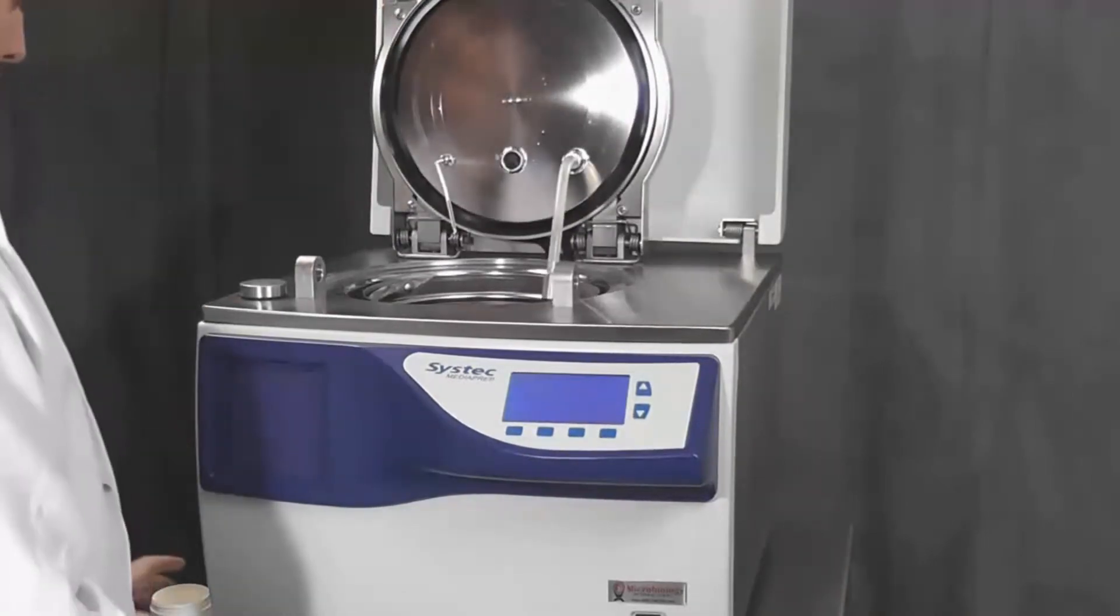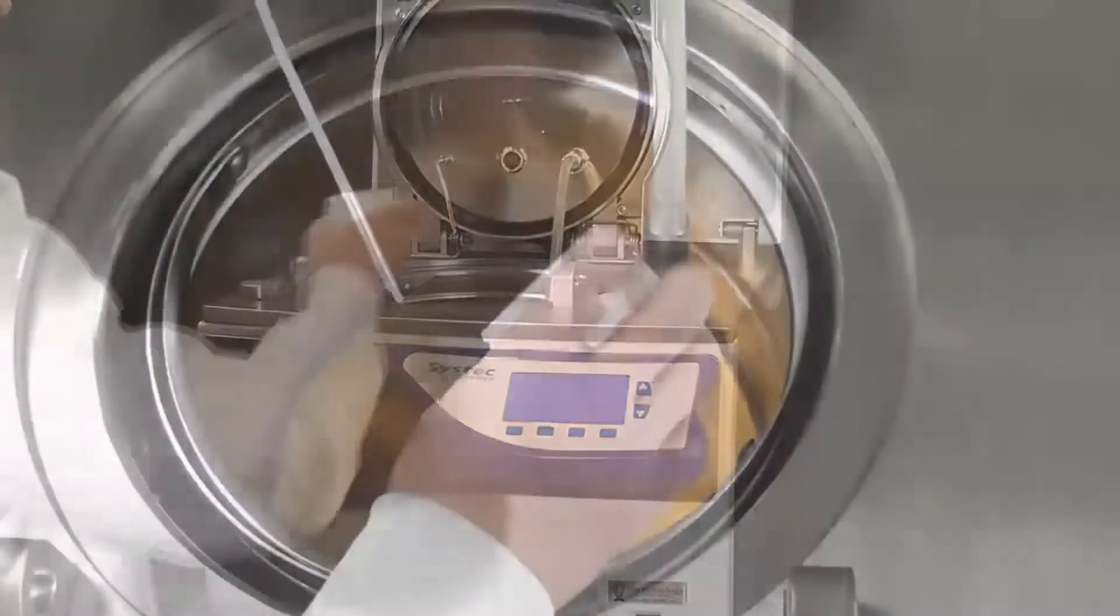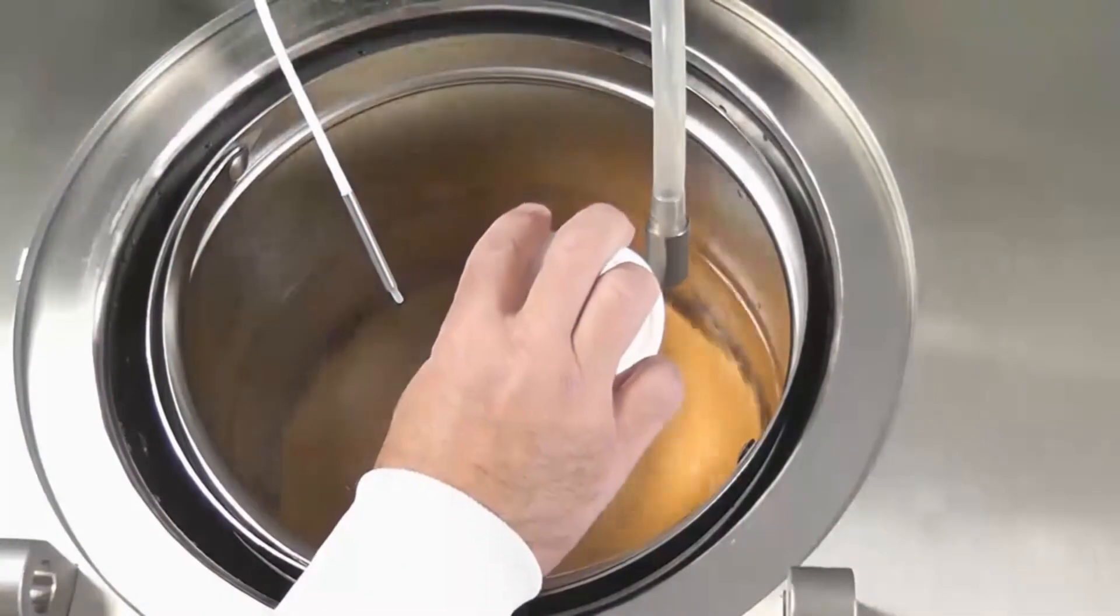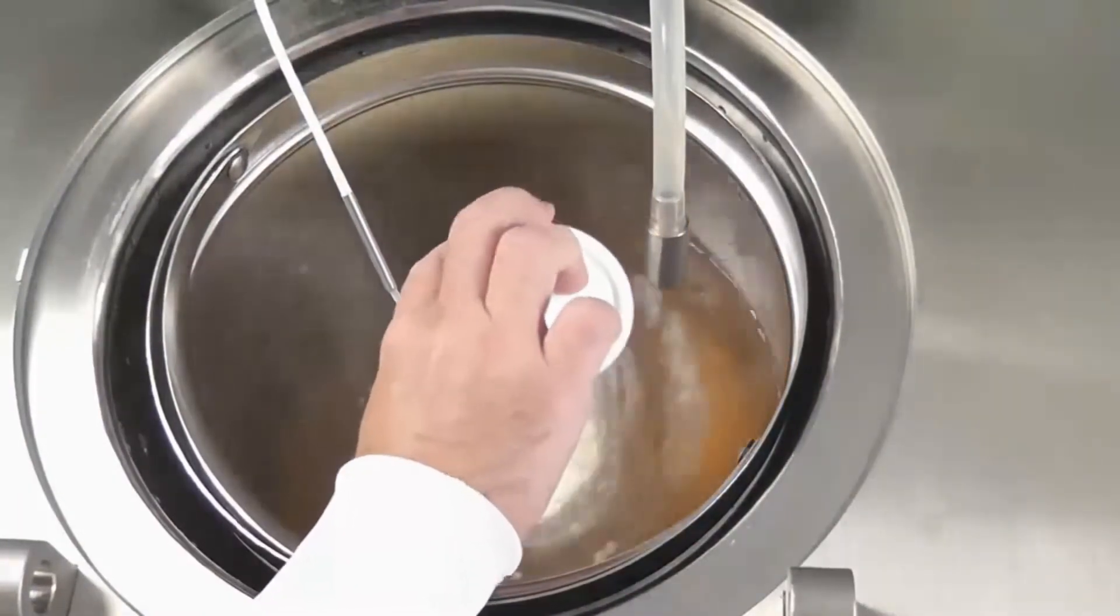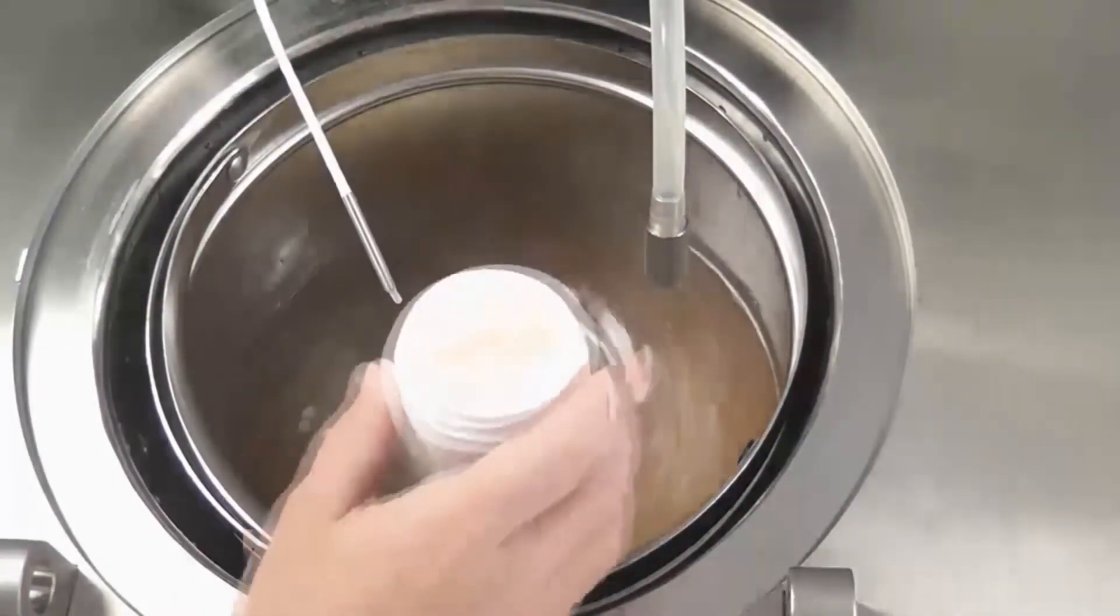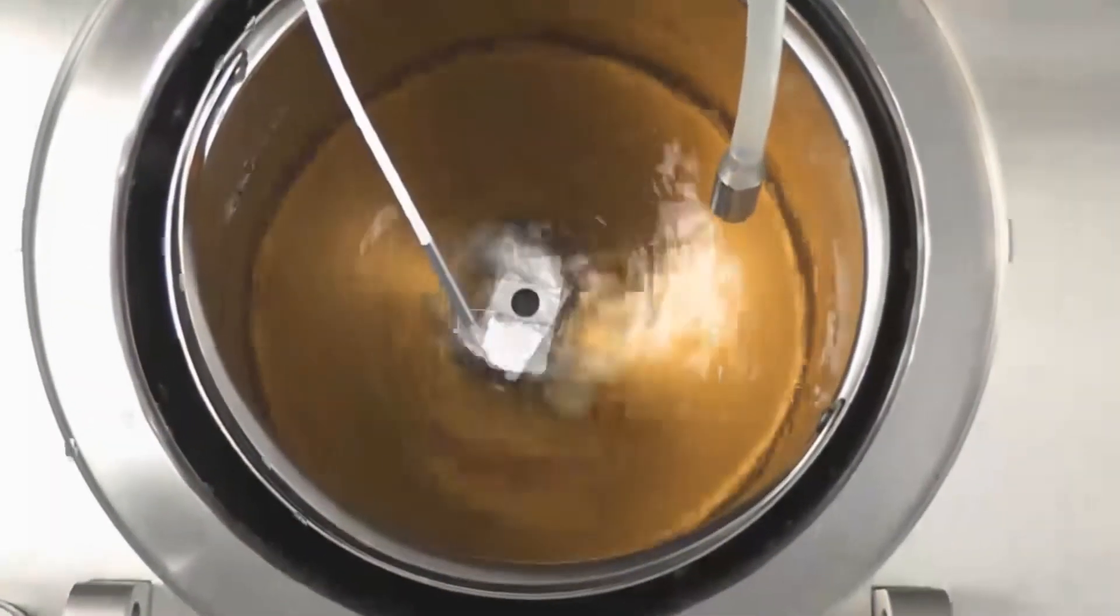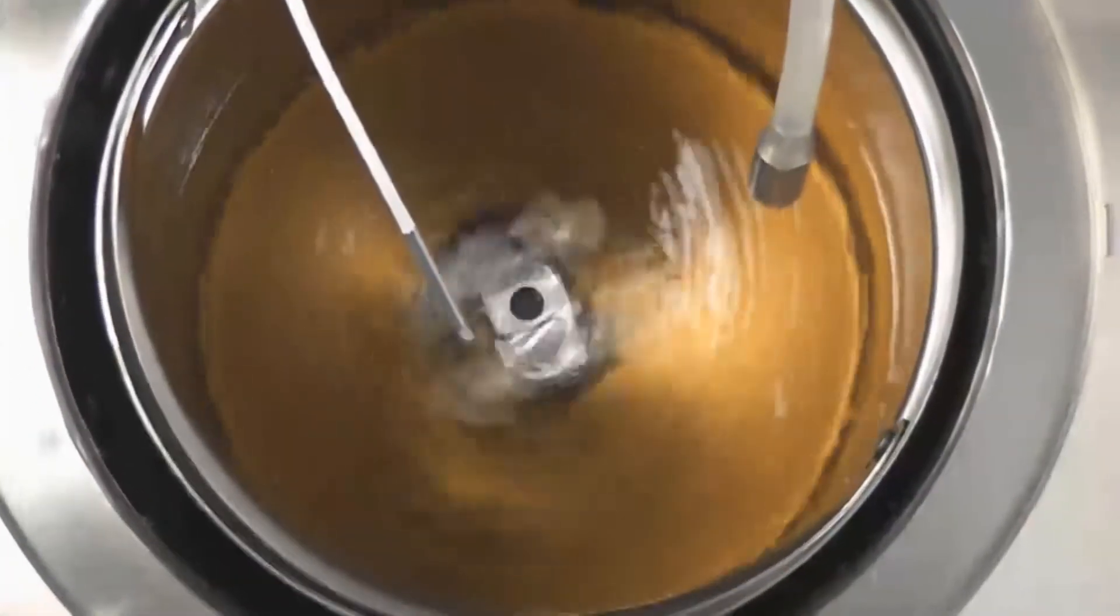After adding the appropriate volume of water in the sterilization vessel, dispense your dehydrated culture media. A magnetic stir bar ensures homogeneous mixing of your media throughout the entire sterilization, cooling, and pouring phases of the cycle.